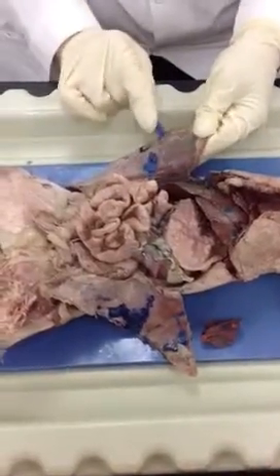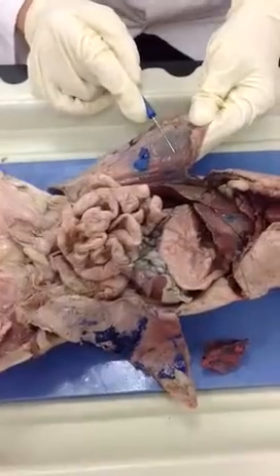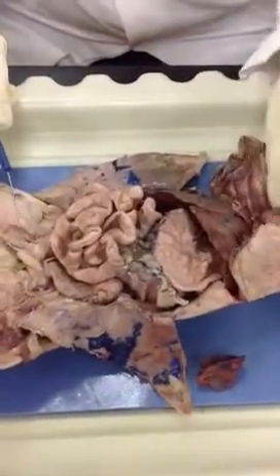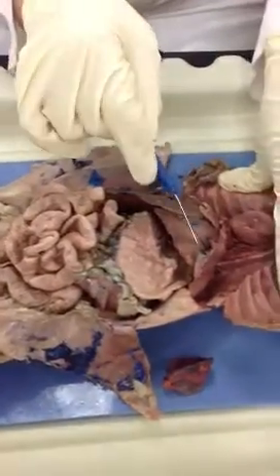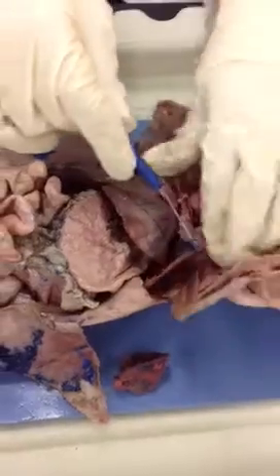Okay. Now, this wall here that we find, what is this, please? Parietal peritoneum. The parietal peritoneum, right? Very good. Now, here we encounter a structure. What is this structure here, please? The diaphragm. Diaphragm. Very good.